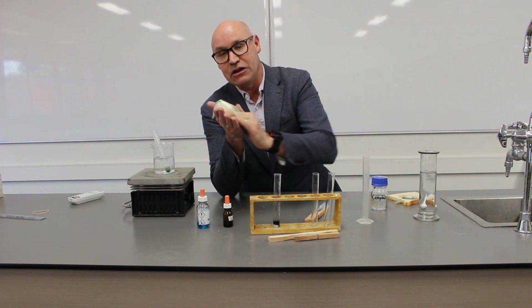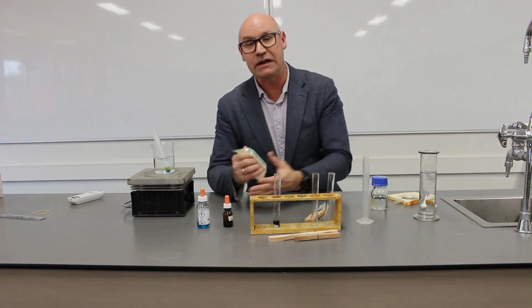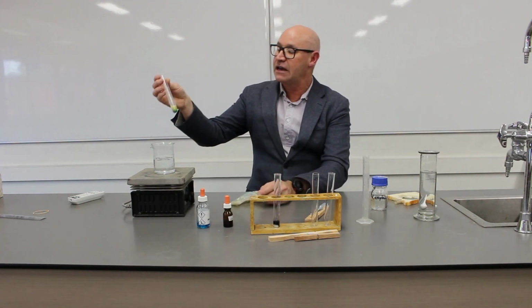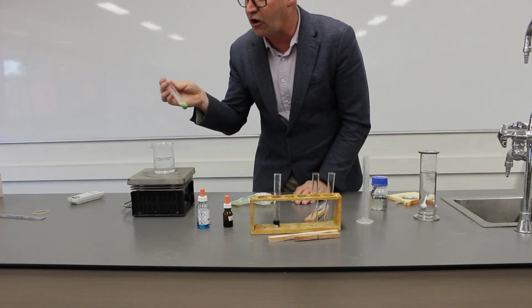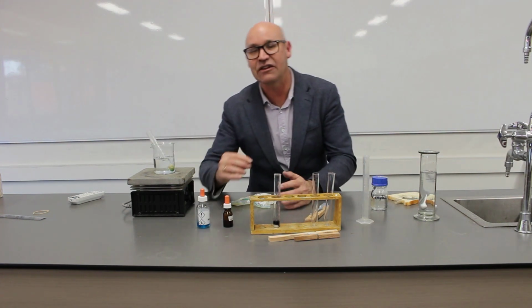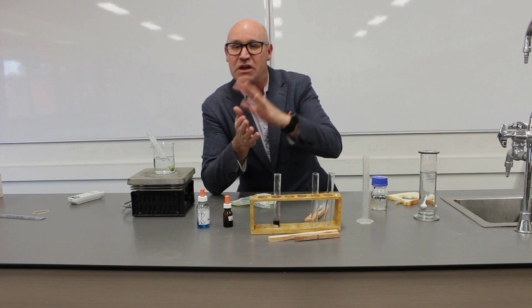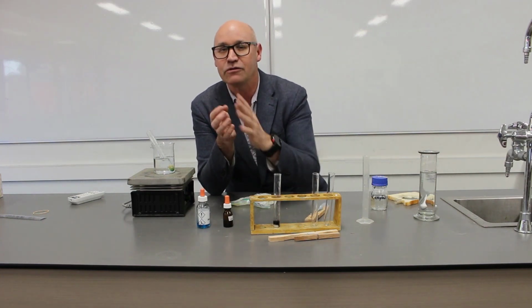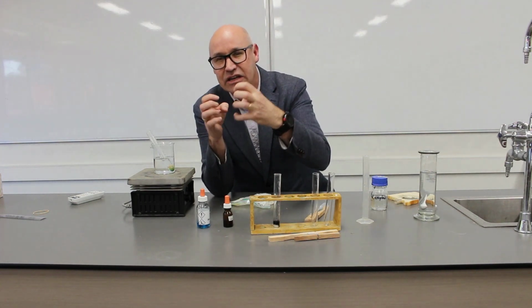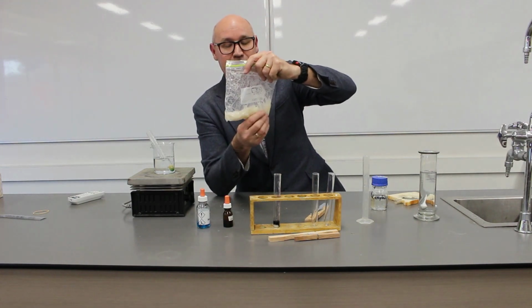Then once we've done that, we're going to repeat the test, both for starch and the Benedict's test for sugar. So this has been several minutes now, and it's maybe getting a little bit of a tinge of orange to it, but really not very much. So what does that tell us? It's telling us that there's really not much sugar in the bread at the moment. So we've just mushed it up with mechanical digestion, but we haven't really snipped the starch into smaller molecules of glucose yet. That's what the enzyme's going to do.